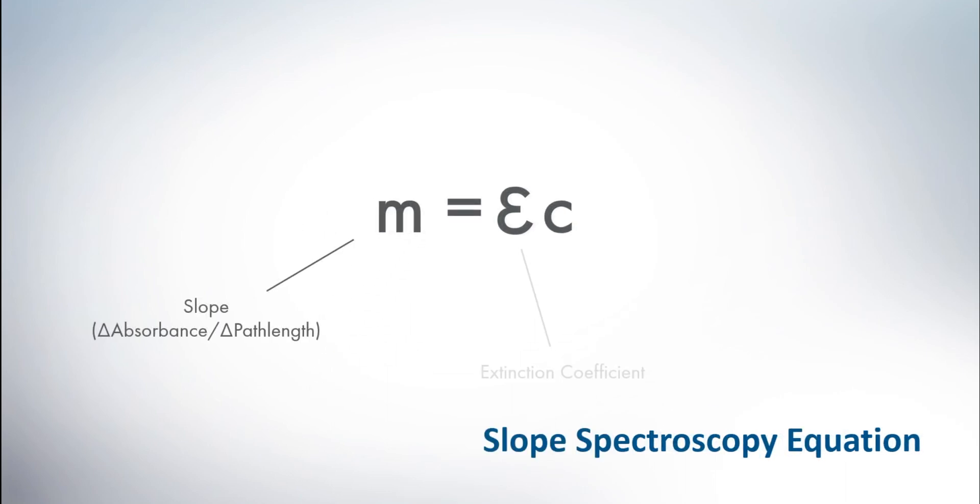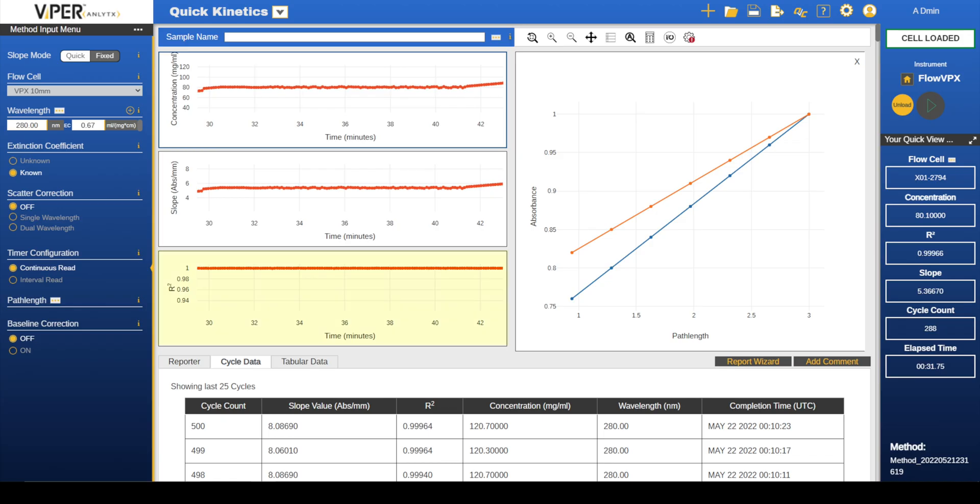Concentration is calculated based on the slope values gathered and the EC value of the solution. The R-squared graph is the linearity of the seven path lengths selected in which we consider reliable R-squared value to be equal to or greater than 0.999.